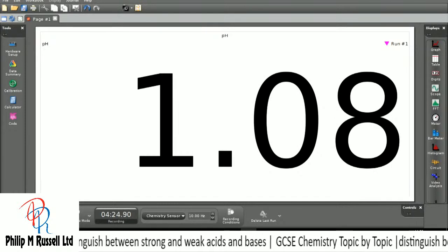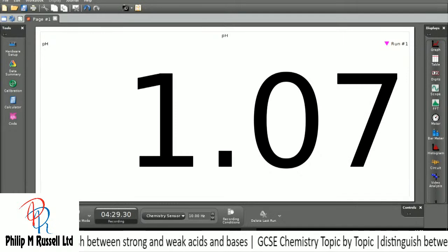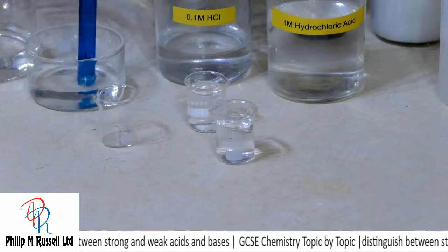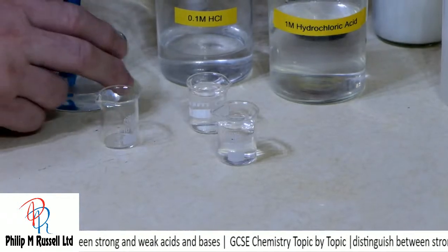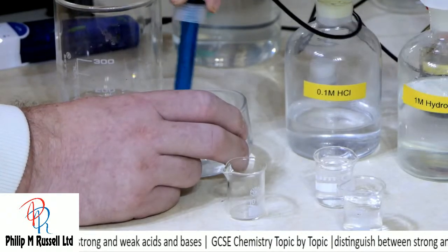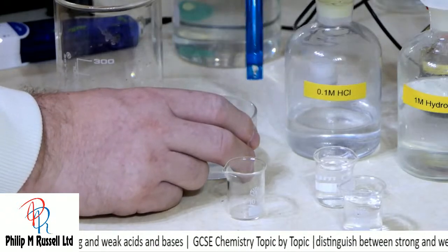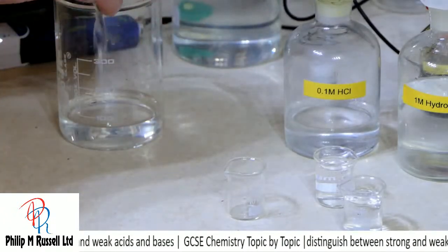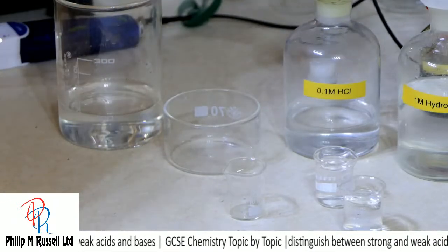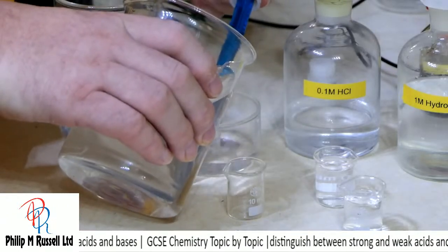It's settling down. As far as I'm concerned though, taking it out, washing it, cleaning it again, the basic idea is that we're seeing that it is less strong. And remember, the pH change of simply 1 means that it is 10 times less number of hydrogen ions.